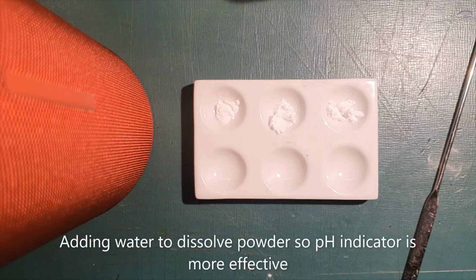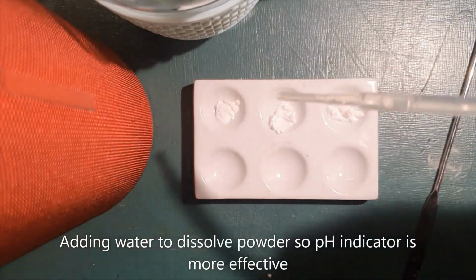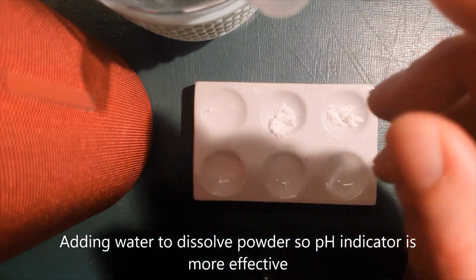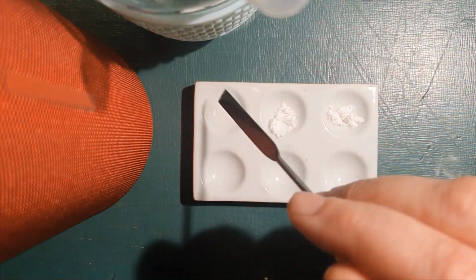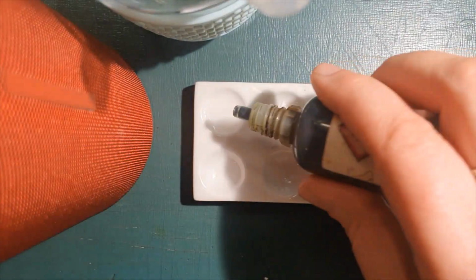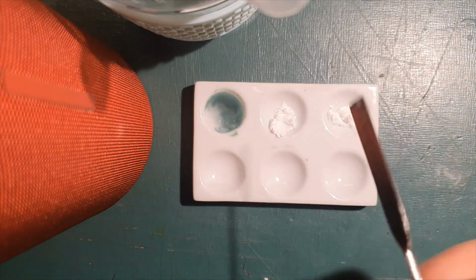Now, the first one we're going to test is reaction to water, or pH. So this is just some water. I'm going to dissolve it in there. So they're not actually looking at a reaction in the water. It's more just that the water is there to help dissolve it, so we can see the color of the pH clearer. So now I'm going to add some universal indicator. 1 drop. All right, so starch.